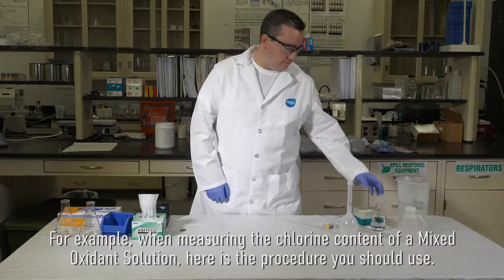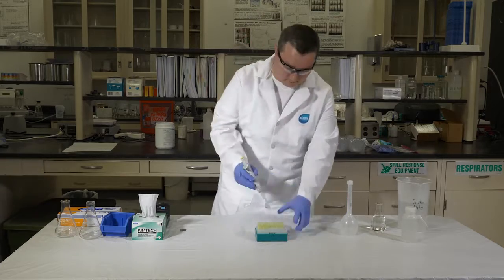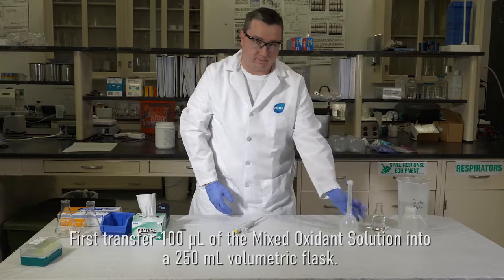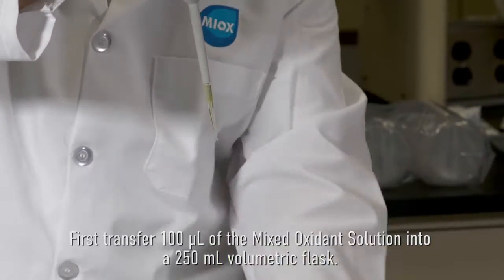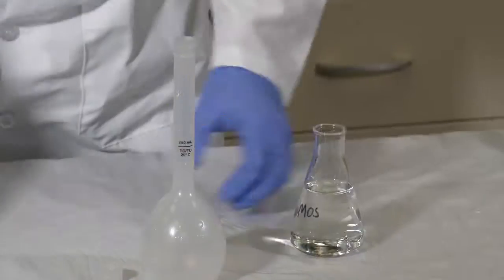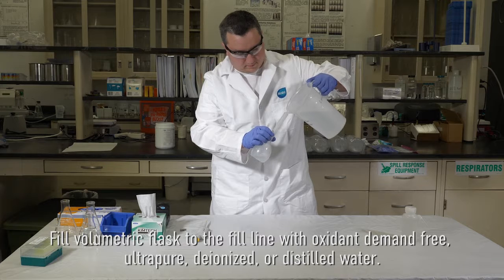For example, when measuring the chlorine content of a mixed oxidant solution, here's the procedure you should use. First, transfer 100 microliters of the mixed oxidant solution into a 250 milliliter volumetric flask. Fill the volumetric flask to the fill line with oxidant demand-free, ultrapure, deionized, or distilled water.